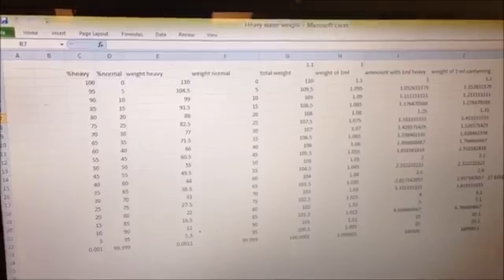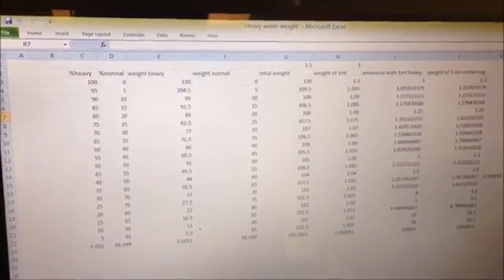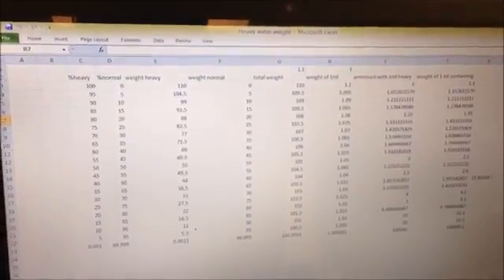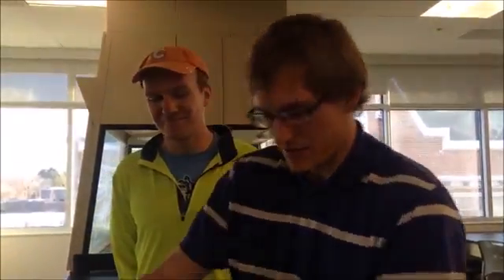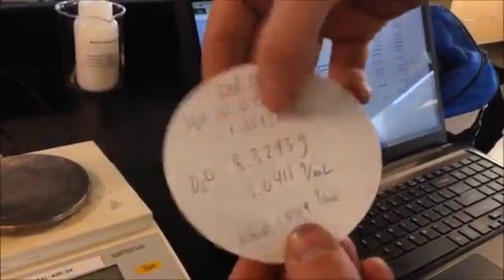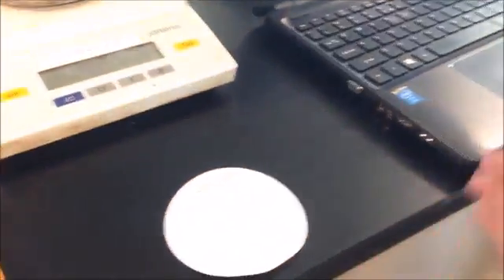Let's do a few more trials to see if that's accurate. I think that's a bit high. So we've done the experiment a couple more times to make sure we're getting an accurate measurement. We've been adjusted for temperature, because water when it heats up, it expands. And we adjusted for the fact that this was one point zero nine instead of exactly one. So we figure that it's between twenty and thirty percent heavy water.